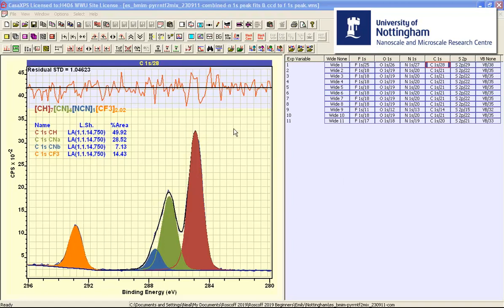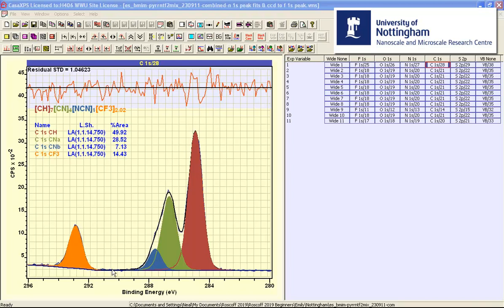The method used to test the peak model is to simulate a sequence of measurements. That is to say, we assume that data are formed from the inelastically scattered background, the photoemission peaks are then superimposed on these two forms of signal that are useful. We have random noise that behaves according to Poisson statistics.